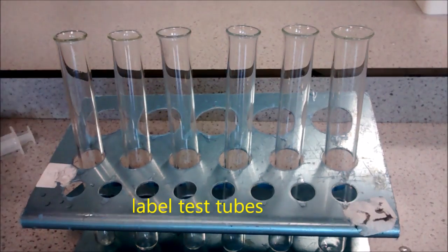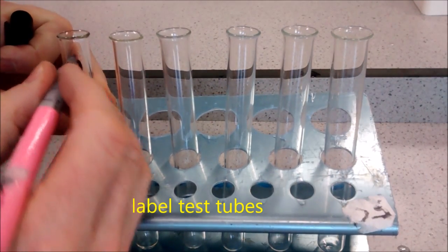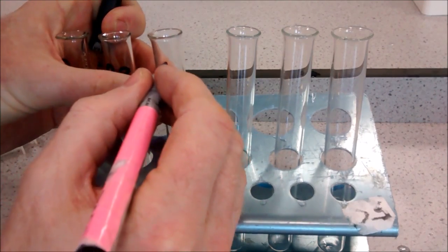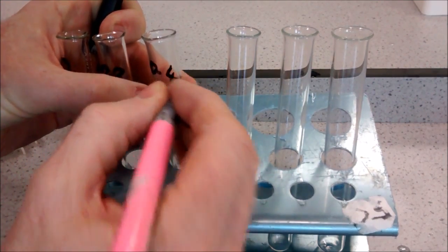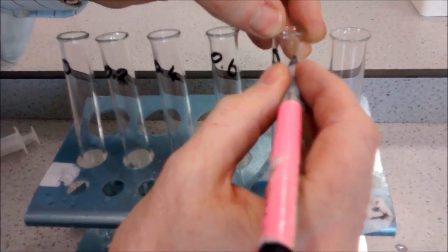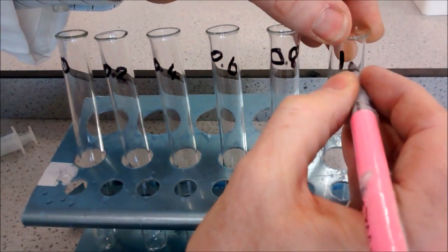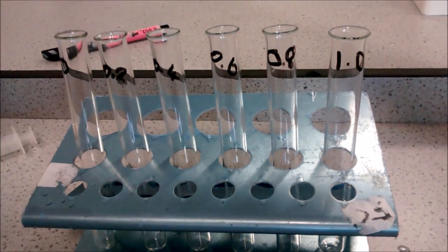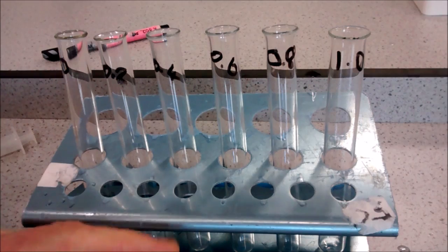Label up your test tubes from zero, 0.2, 0.4, 0.6, 0.8, and up to one molar sucrose, and then add the sucrose solutions in the right quantities.